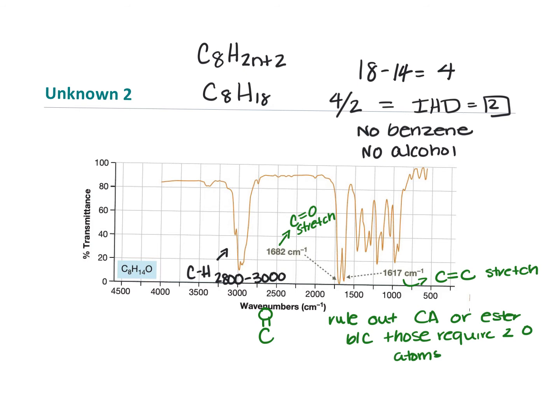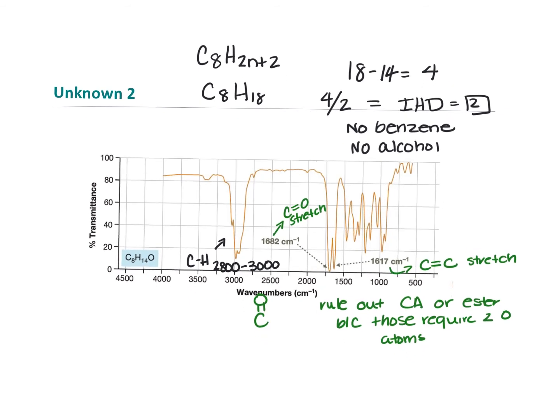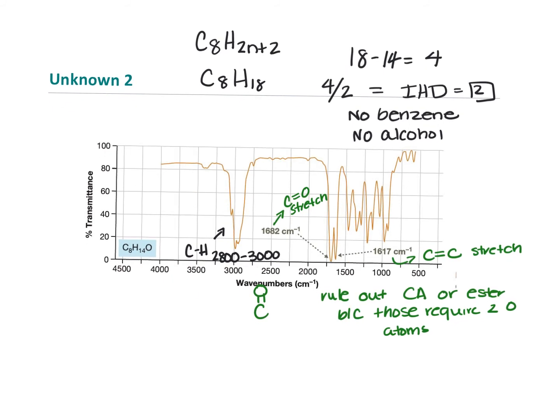So the information we can rule out is just as important as the information that we can identify, right? The structure here says we only have 1 oxygen. And so we've got a C double bond O. That's probably where that oxygen is.